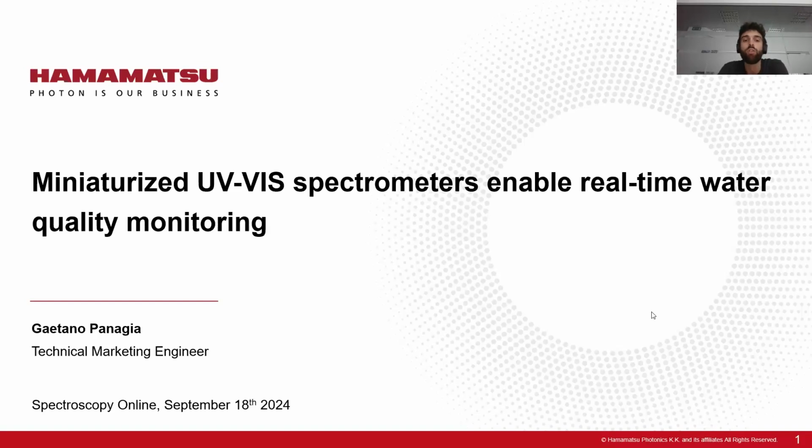And today I want to talk about miniaturized UV visible spectrometers and how they are enabling real-time water quality monitoring.